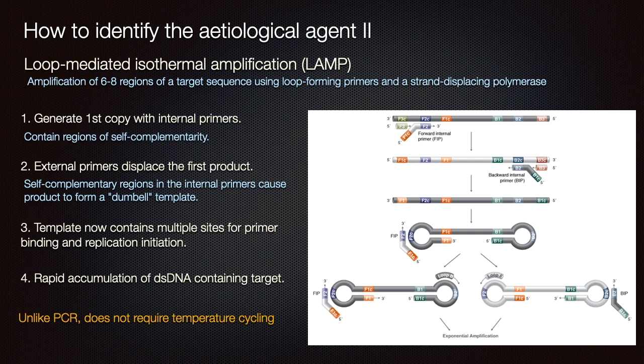One of the drawbacks to LAMP is that it's not easy to quantify accurately. So we can get crude or semi-quantitative information from LAMP, but quantitative information is somewhat more difficult. In addition, setting up a particular LAMP reaction and optimizing it can be somewhat cumbersome.